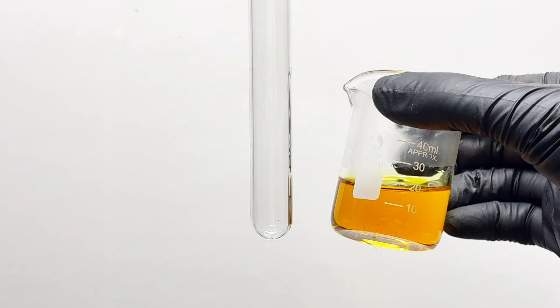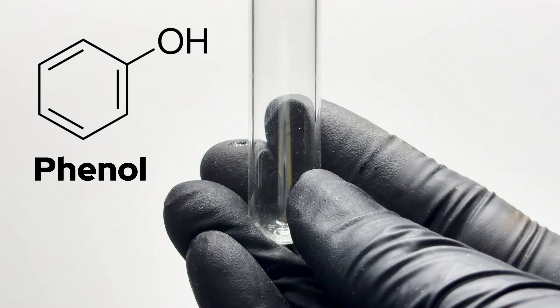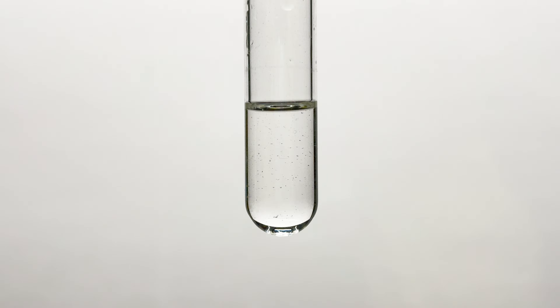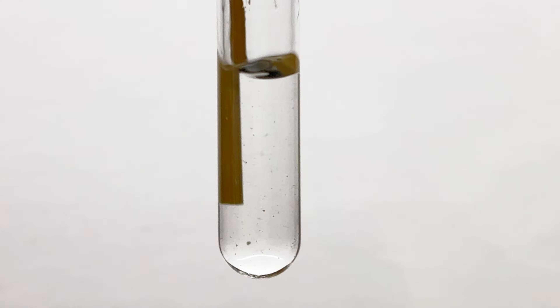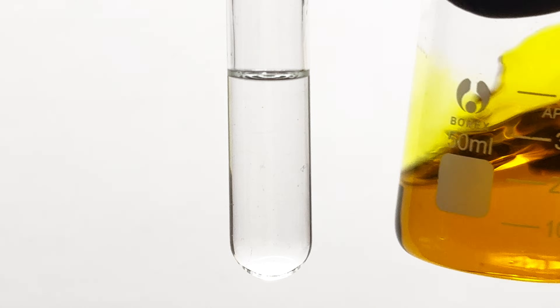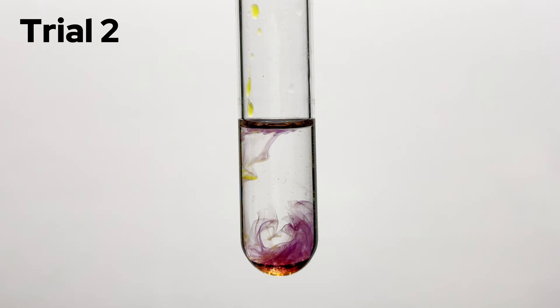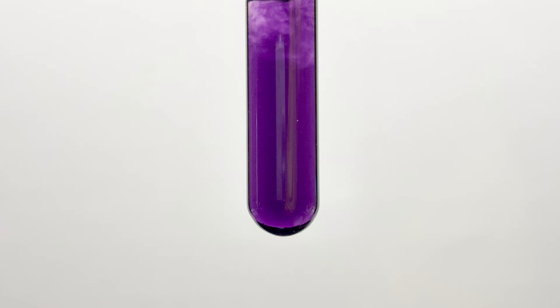FeCl3 is also employed a lot in laboratories. There's something called the ferric chloride phenol test, where dilute drops of FeCl3 are dropped into a substance to test for the presence of phenols. My setup is a test tube held by a stand, into which I transferred a couple of mLs of ethanol and dissolved some salicylic acid — I chose ethanol as the solvent since salicylic acid is not very soluble in water. Adding in our ferric chloride, you can see a beautiful purple color forming, confirming the presence of a phenol group.